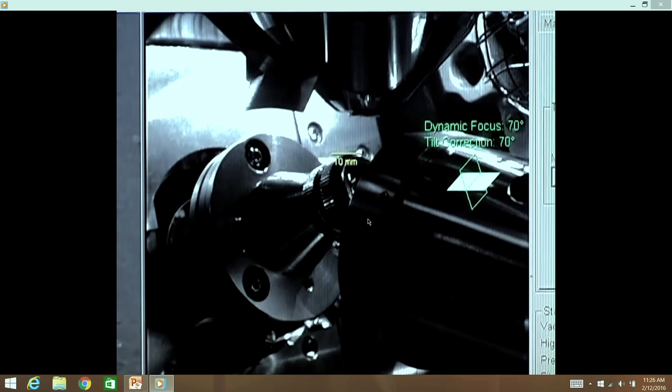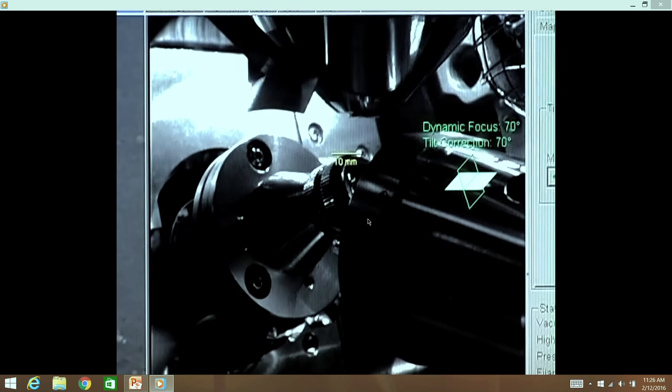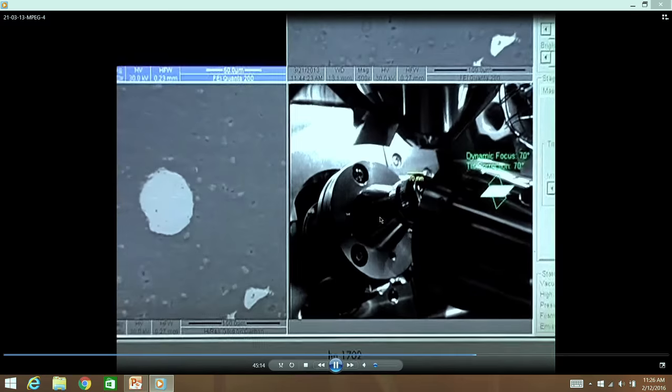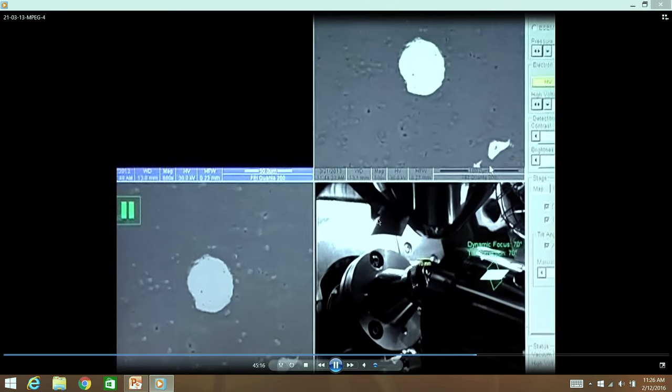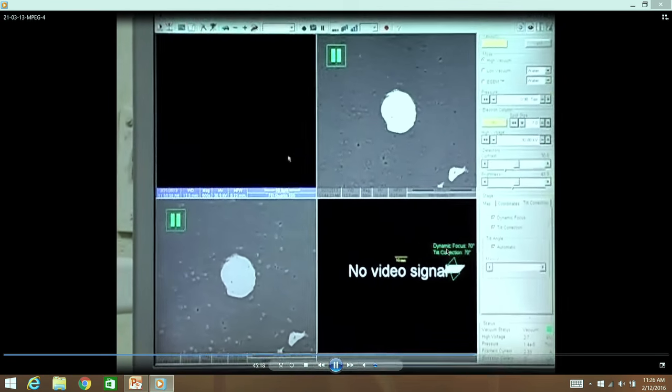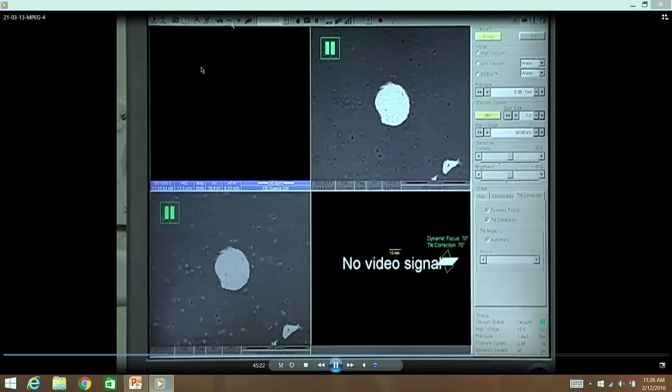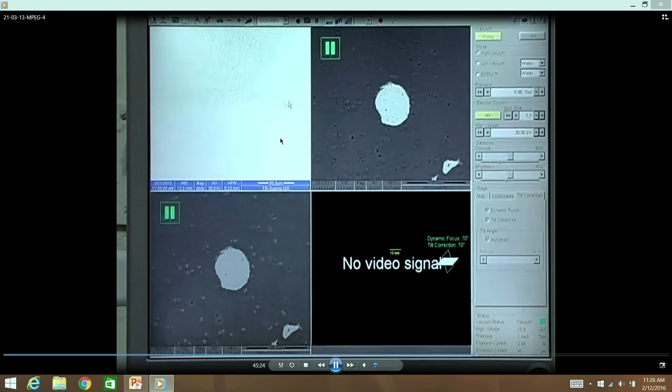What you have to do is, one of the primary requirements of producing an EBSD sample is a very fine polish, which is very difficult, and is done by electrolytic polishing. You first generate a secondary electron image of the sample.